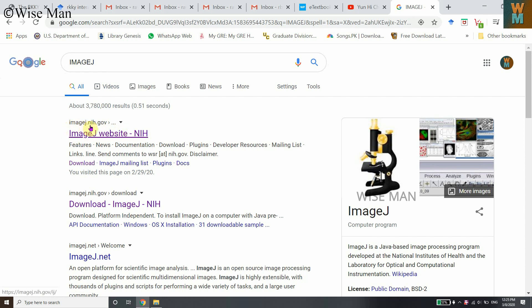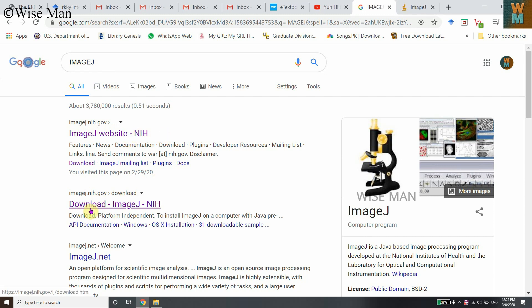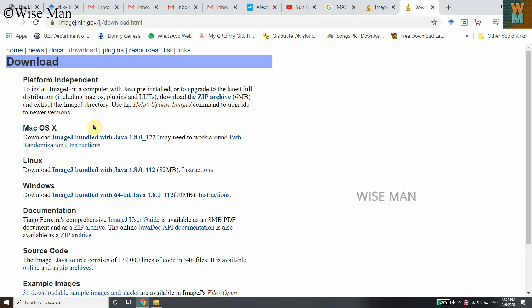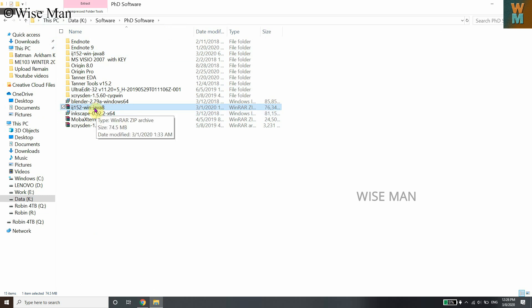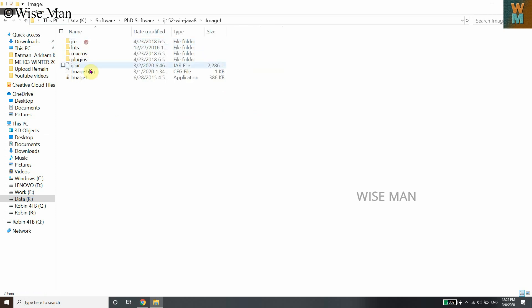You can search for ImageJ on Google and find the imageJ.nih.gov website to download it. You can go directly to the download page where there are different platforms available — Mac, Linux, and Windows. Download your respective version. Once downloaded, you'll get a zip file; extract it to get the ImageJ application.